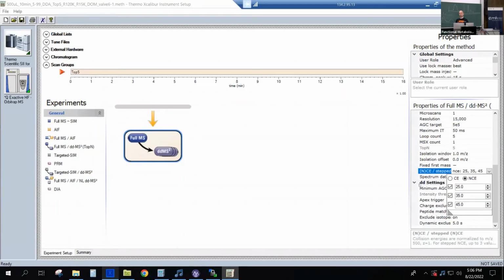That way I make sure that my data remains comparable within data sets, right? Because then I just throw in, I don't know, samples from 5 years ago from San Diego to stuff I run now, and it's the same collision energy settings. And then I assume that they should still cluster together because they should result in the same patterns.